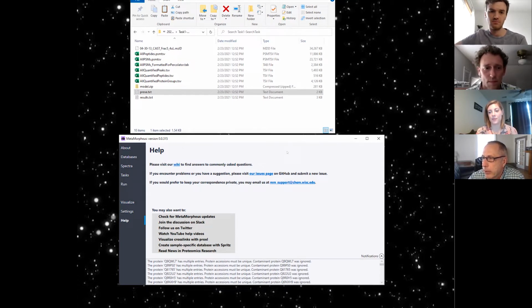To that end, we try to make it really easy for people to get in contact with us and let us know when things go wrong. Things do go wrong. Bugs happen, errors happen, and sometimes there are new features that people want. First, we have a wiki on the GitHub. That'll take you right to our GitHub page. There's a lot of information there that people can explore, and there's also a big glossary. All the terminology that we use, like all of the different tabs for the data files, is explained.